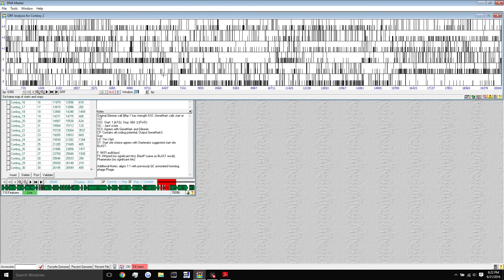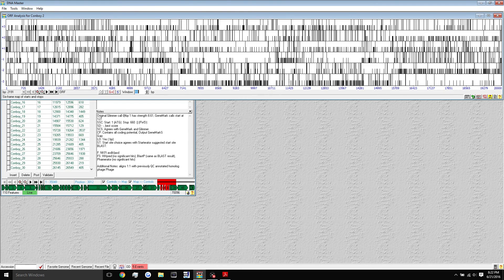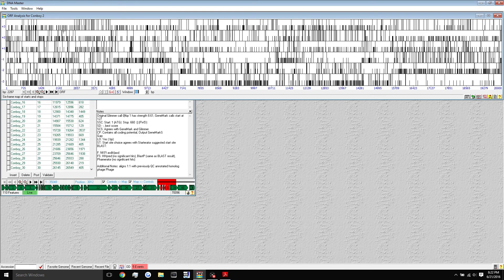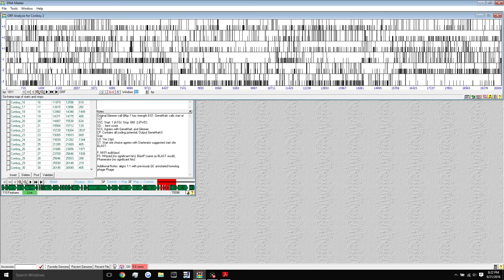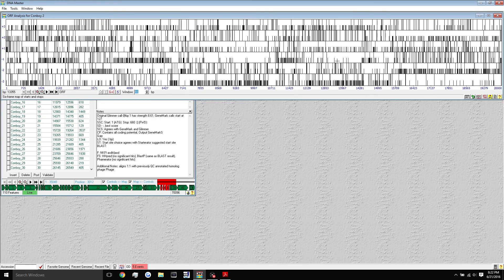Now, this can look a little bit confusing, but just know that these are the different open reading frames. This is the plus one, plus two, plus three, or the forward, and these are the minus one, minus two, minus three open reading frames.